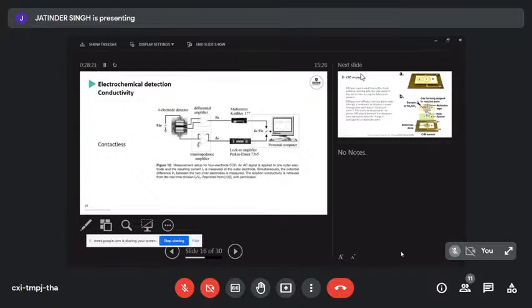Well, that's my next thing that I was going to do anyway, was give you my budget conductivity detector that I sneakily held behind. So this is my old cheapo way of making microfluidic devices with an integrated detector. Any of you here that's got a hobby in electronics, made a printed circuit board? So this is just a normal copper printed circuit board where I used a mask to etch and got conductivity detector electrodes in there.